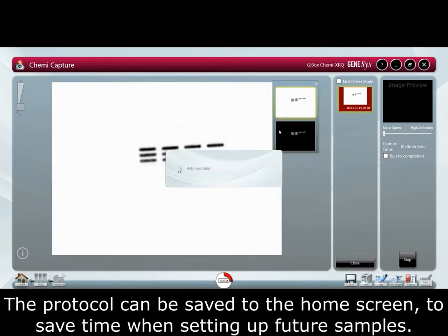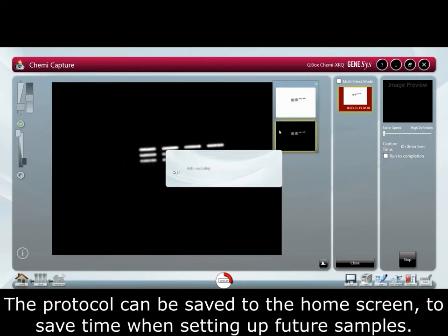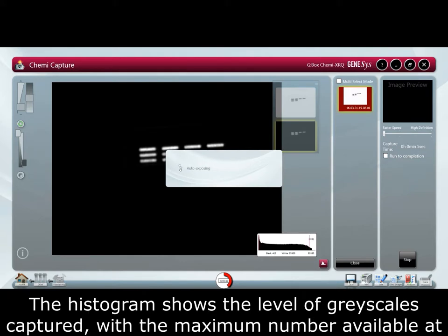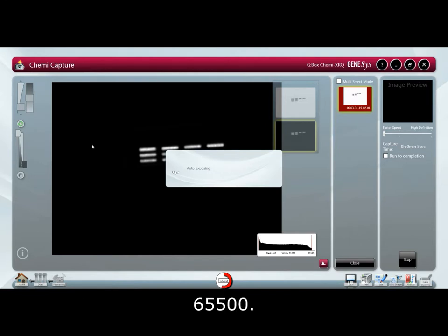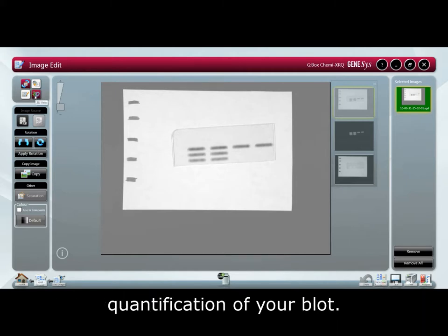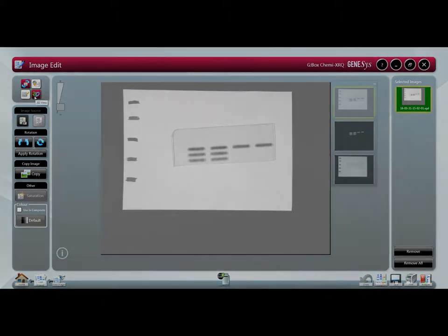The protocol can be saved to the home screen to save time when setting up future samples. The histogram shows the level of grayscales captured with the maximum number available at 65,500. We can also add annotations to the image and directly export to GeneTools for quick and simple quantification of your blot.